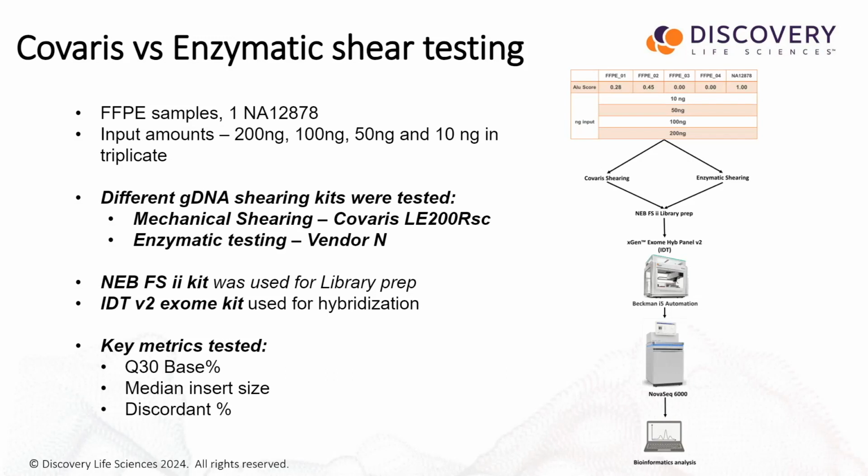This entire process of the library prep, exome capture, wash, and the final amplification is 100% automated on our Beckman instruments. Both i5s and i7s have the capabilities to perform this assay for us for either Kapa or IDT exome capture, and even the Twist exome V2 capture. The sequencing is on the NovaSeq 6000. We're targeting approximately 150 to 300x coverage with the IDT V2 exome baits.